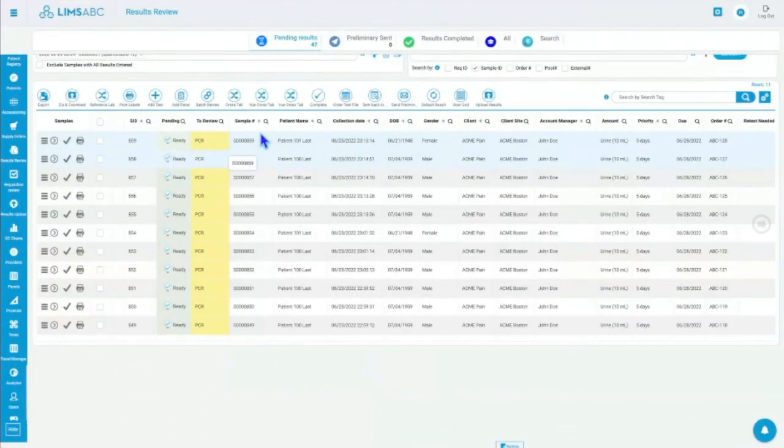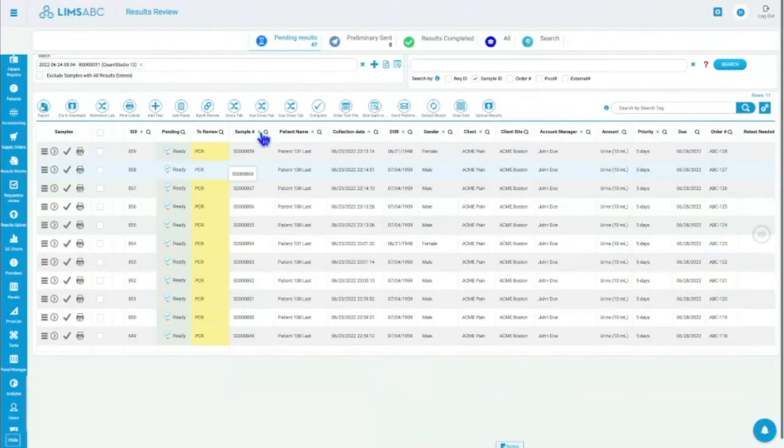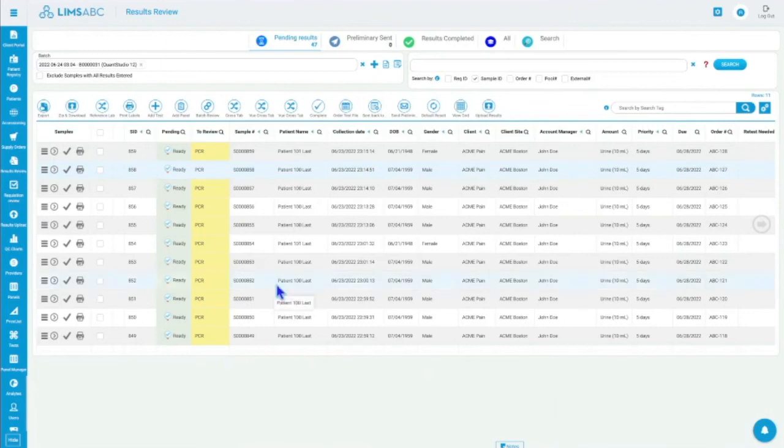We can do it two ways. We can integrate with a third-party system that does that, and we have companies that we can recommend to you. We work with Arcstone, but we work with others as well. So it really depends on your preference. It's the cost, the quality of the report, the service, and all of that. So we're not experts on that, but we're experts in integrating with them and getting the report back.